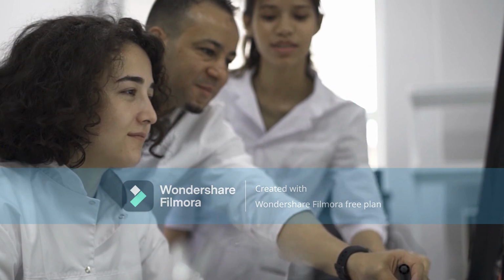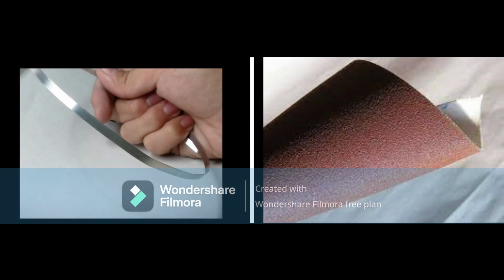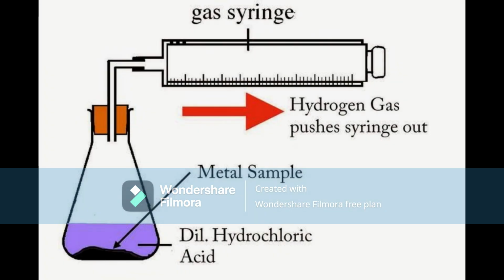We'll take magnesium metal and dilute hydrochloric acid. Take the magnesium metal and first clean it with sandpaper, because a magnesium oxide layer will be there on the magnesium metal, so you have to remove that. Now take that cleaned magnesium, and in an RB flask or even a conical flask, take the dilute hydrochloric acid, and a gas syringe is attached. I will show you how the setup looks. So this is the setup. You can use the conical flask or RB flask, and the gas syringe is attached to it.